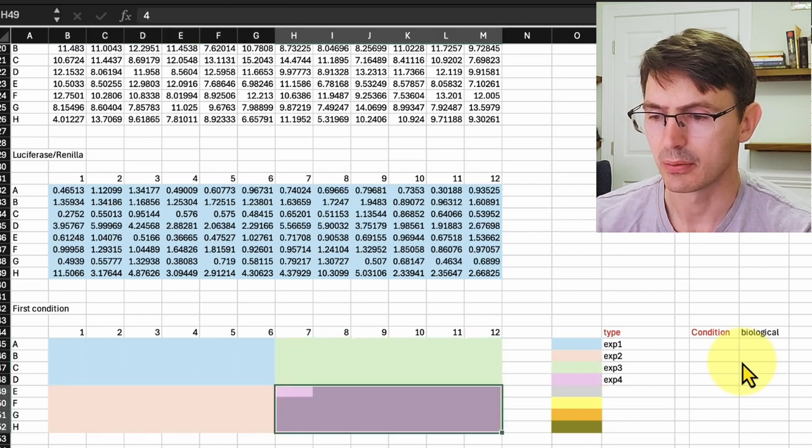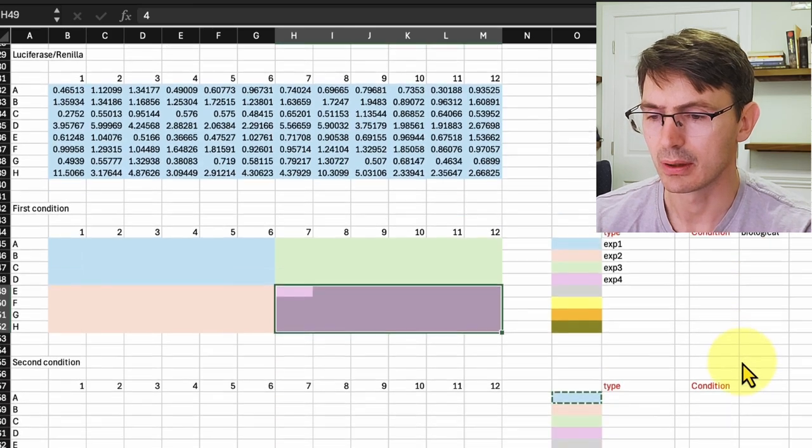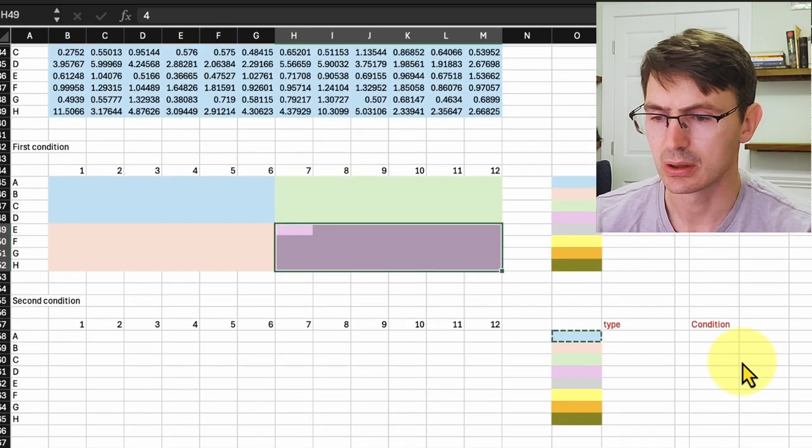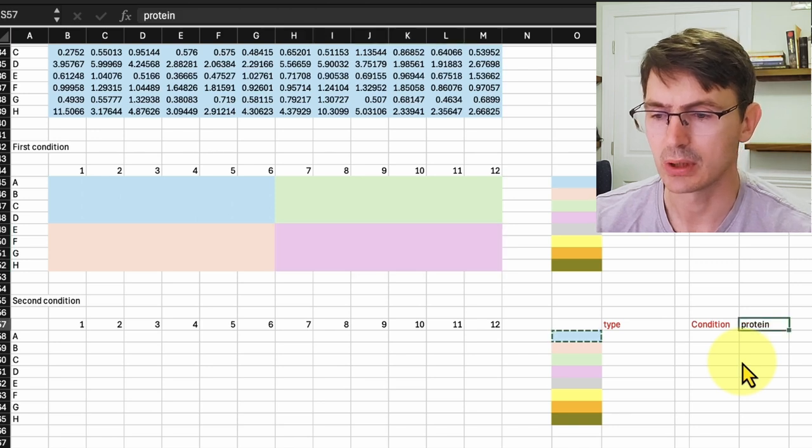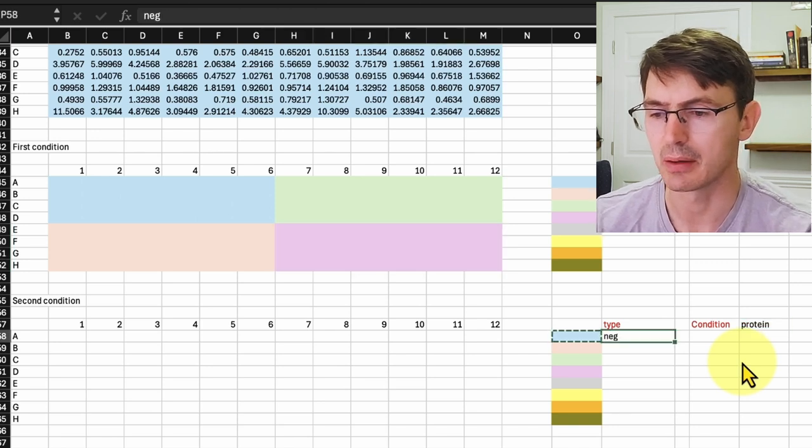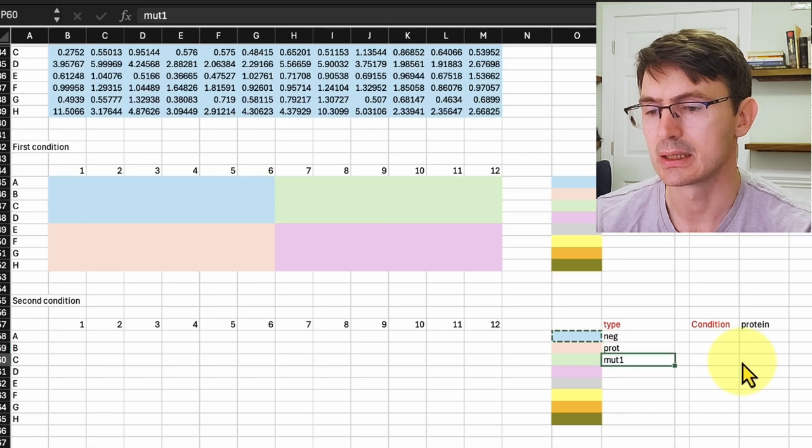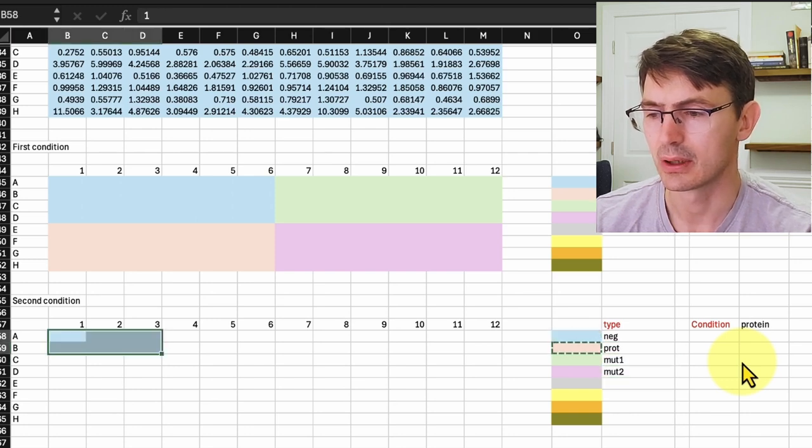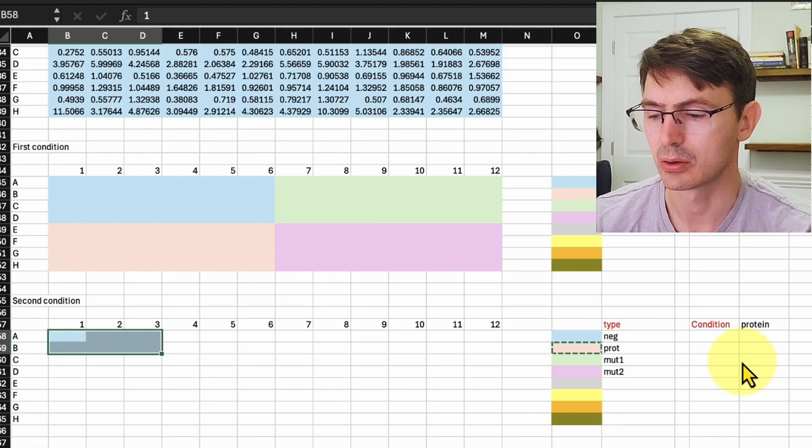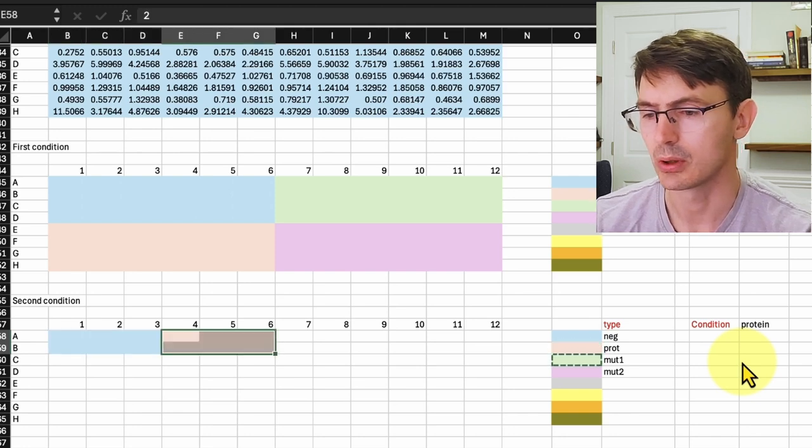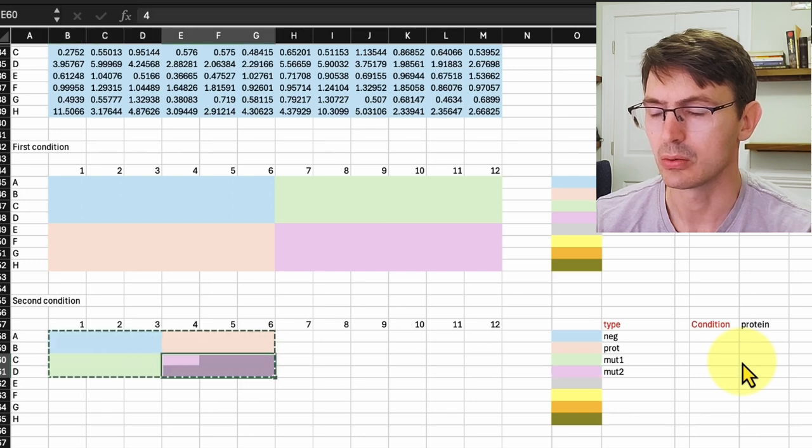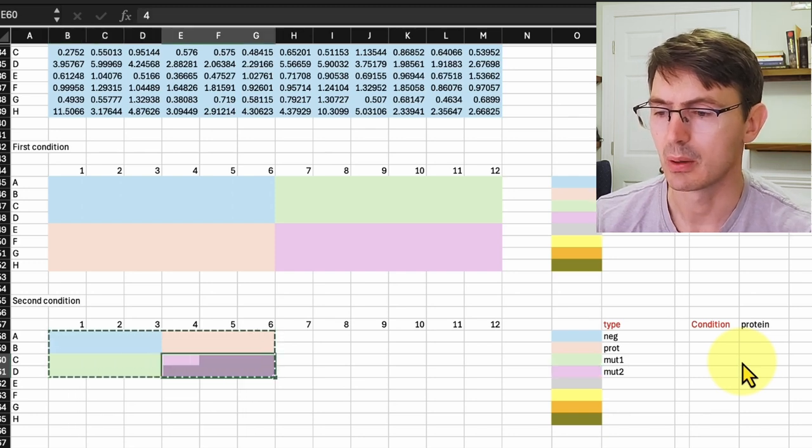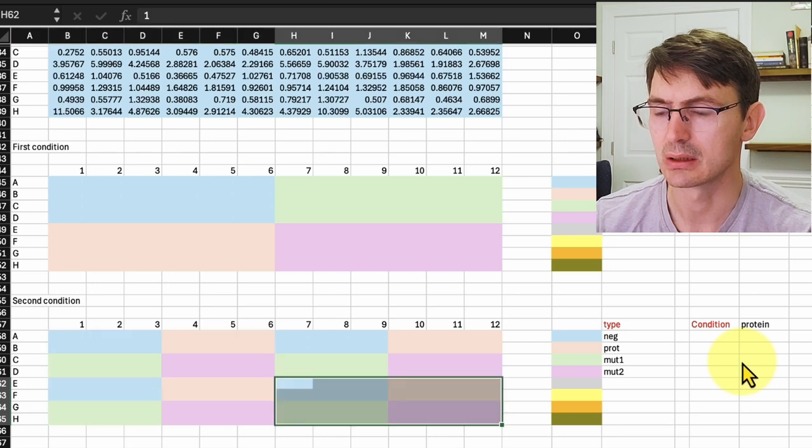The next condition that we want to indicate is the proteins that we use. So we use the negative control, the protein itself, and two mutants. The first six wells are for the negative control, the one next to it for the proteins, and then we have the mutant one and the mutant two. And we did the same for the different biological replicas, so we just replicate that.